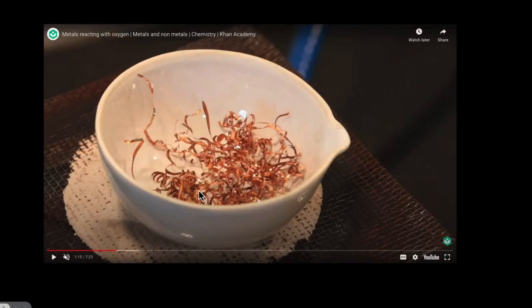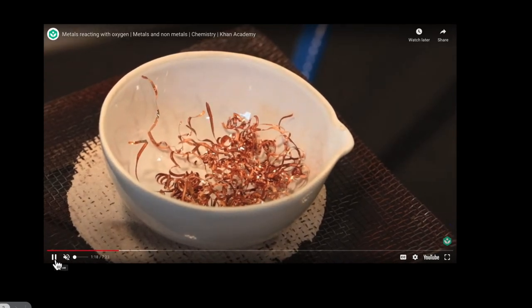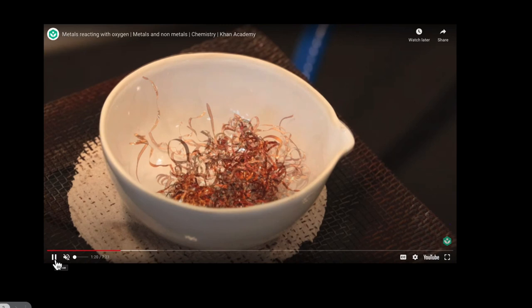This time we're gonna take a few copper ribbons and we're going to heat it. Let's see what's gonna happen... and you see it turned brown.